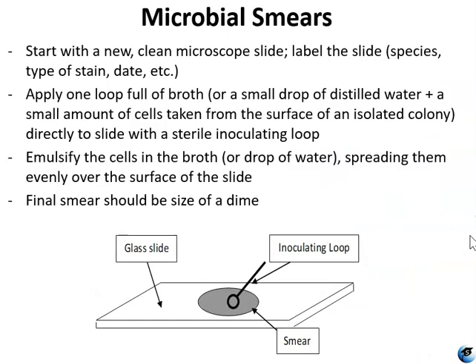So how are these stains done? Well, first, you've got to prepare the cells to be stained. And while you can do a simple stain on a wet mount slide, in fact, you will be doing this for experiment 1, before doing any of the other types of staining techniques, cells must first be affixed to the slide via dry mount, which is also known as a smear.